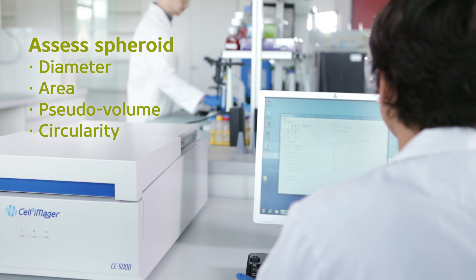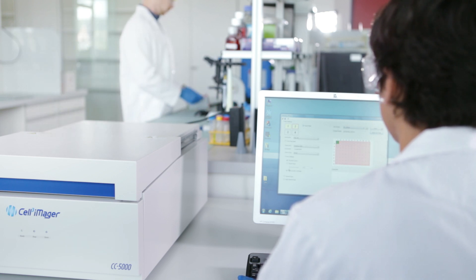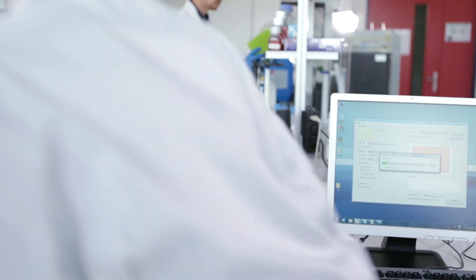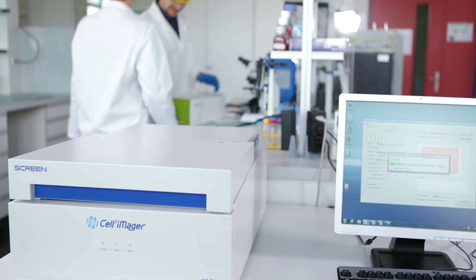Performing a scan using the Cell 3 Imager is a simple process, requiring less than 2 minutes per plate to scan and measure, following initial setup. First, assay plates containing spheroids are loaded securely into the 4-plate scanner stage.